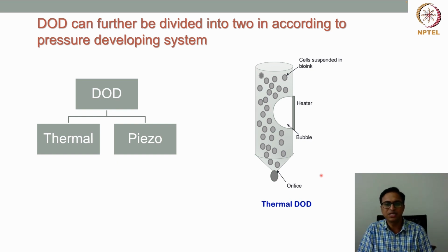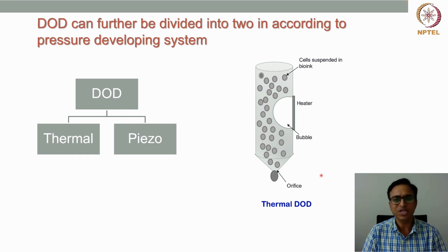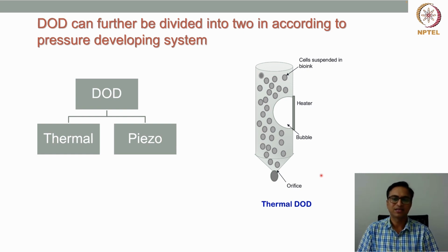with this printing technology. But because of this very tiny, very fine orifice size, like 50 micron, there can sometimes be nozzle clogging. So we need to choose the process parameters accordingly so that the printing process can be smooth, accurate and efficient, right? So that's the principle of thermal DOD printing. Based upon the heating and bubble production, the droplets are generated and used. So thermal DOD printing is very widely used for different applications.